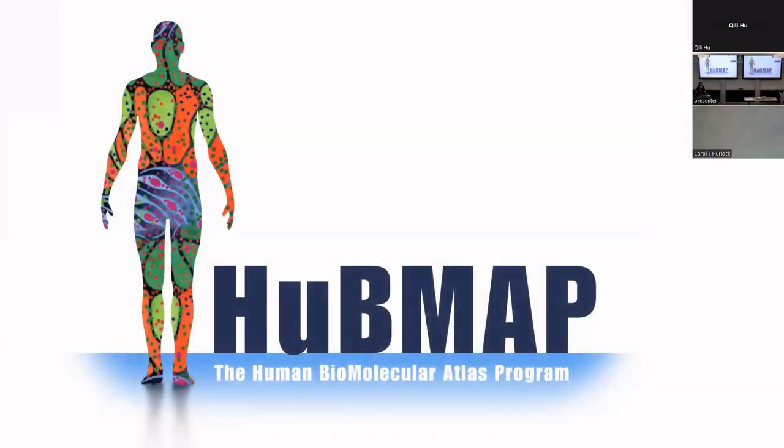So we have been involved in an NIH program called HuBMAP. It's called the Human Biomolecular Atlas. So I'll give a laser. I think the laser will be helpful for later slides. So the Human Biomolecular Atlas program is going to establish a global platform. It's open for all types of countries, people who are doing biomedicine or human health. You can see those cells, how we can map those cell subtypes and establish this library for references.